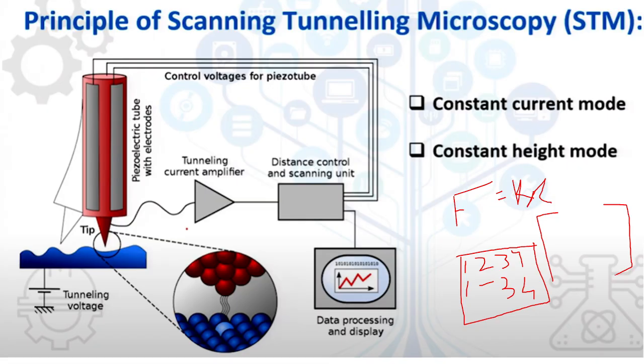Is it clear now how the image is forming? Because your instrument, the detector, is not actually forming the image. From the detector you are getting the signal. It is detecting the signal. After that, whatever signal it is detecting, you prepare an array of matrix, and then the software will form the image based on the matrix.